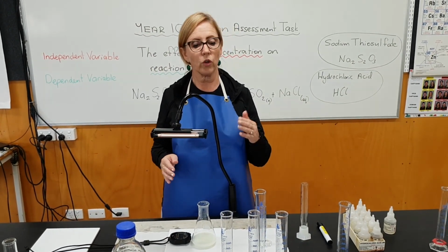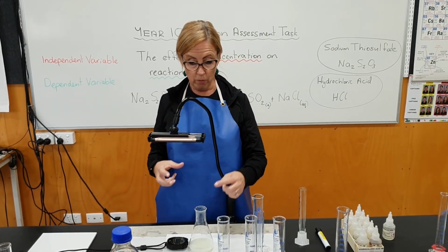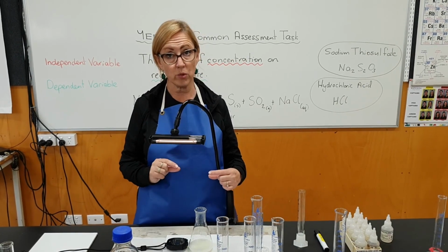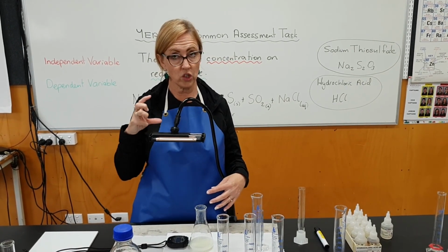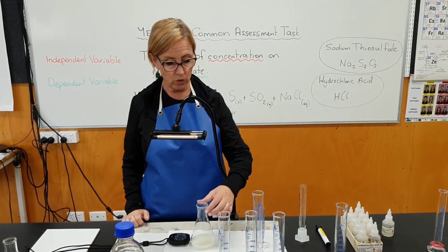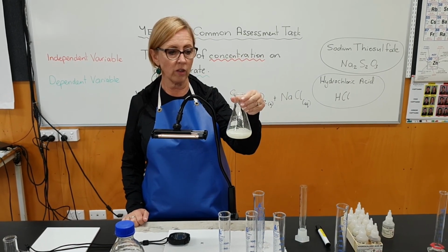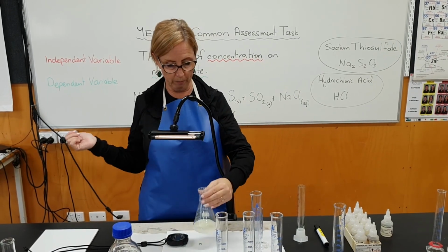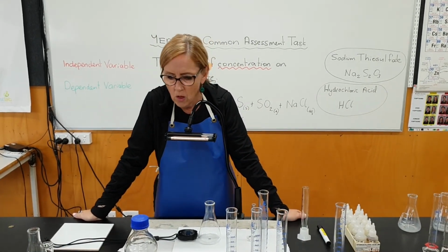So in a moment, we'll continue to dilute the solutions. Remembering that this one was 40 mils of thiosulfate with 10 mils of water. Our first run was just thiosulfate, 50 mils. Now please take note that every time we have solution in here, it always adds up to 50 mils. The only thing we change is the ratio of the thiosulfate to the water. Okay, so we're now up to our third reaction.